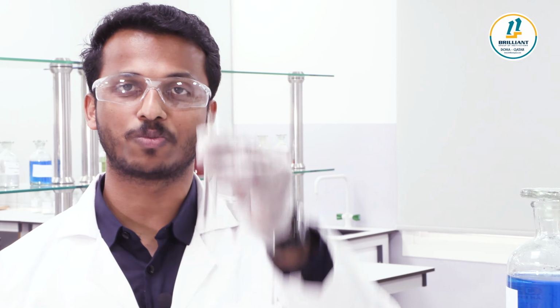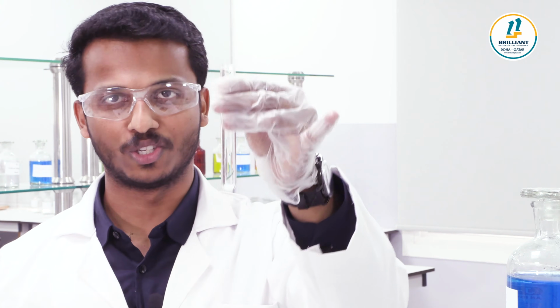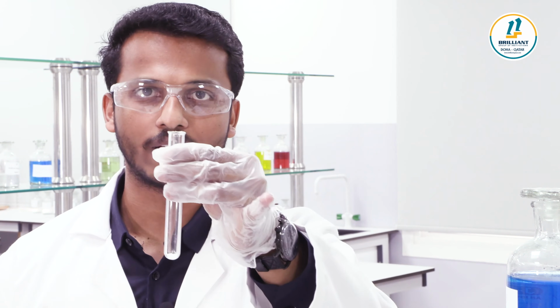Now we can do the confirmatory test for the carbonate ion. We saw that the given salt may contain carbonate because of the brisk effervescence. Now we have to confirm whether the given salt contains carbonate as an anion. Only after the confirmatory test can we fix our answer. I'm going to take a test tube again and add a pinch of salt. Always, when you're doing the experiment, add a pinch of salt.